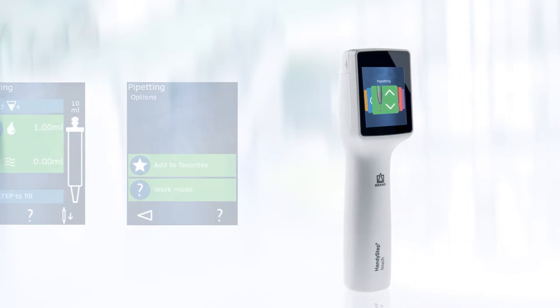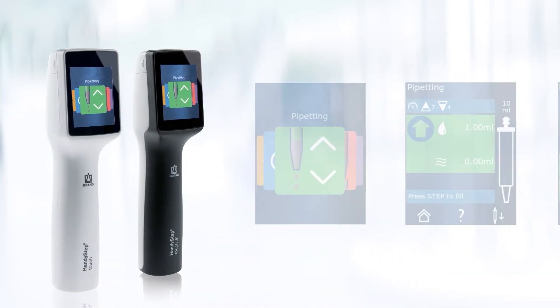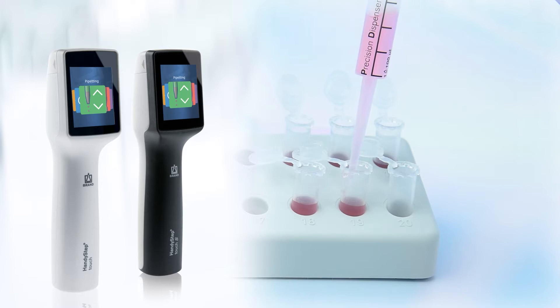The Pipetting Mode is available on both the HandyStep Touch and the HandyStep Touch S. The Pipetting Mode allows a set volume to be aspirated, then dispensed. This mode is ideal for dispensing large volumes or more viscous solutions.